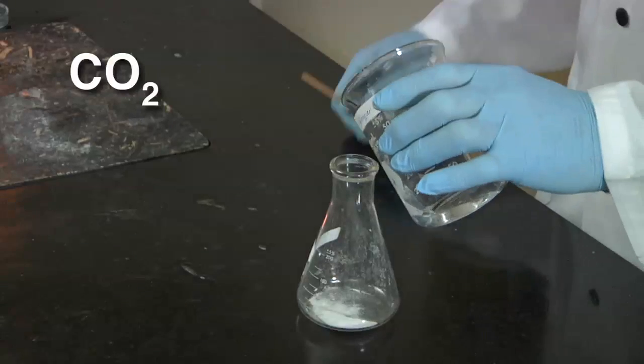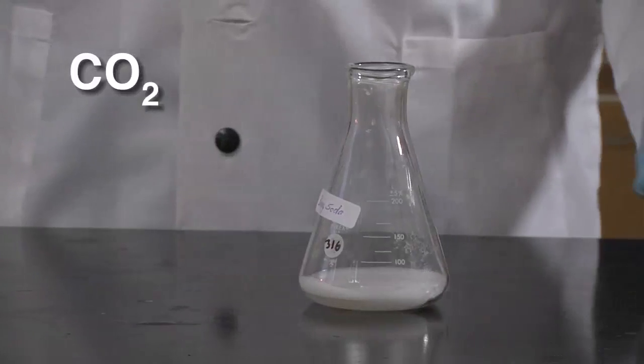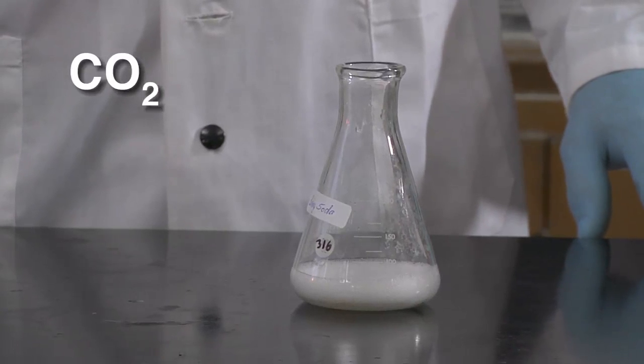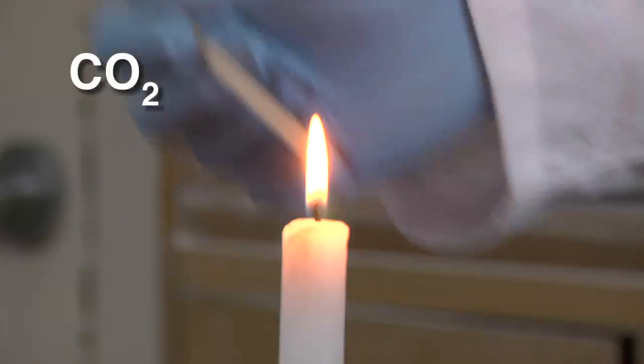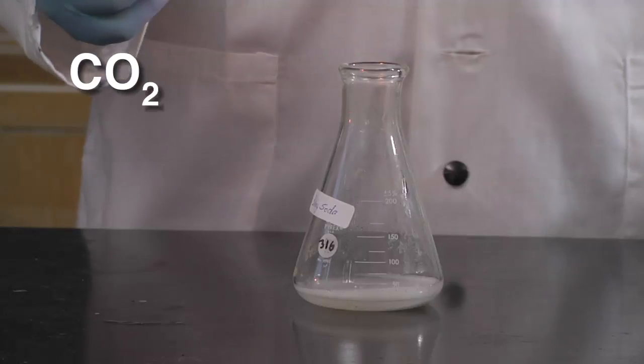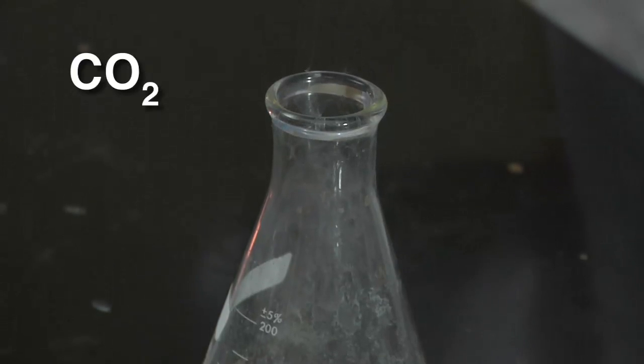To produce carbon dioxide gas, add about half of the vinegar to the Erlenmeyer flask with the sodium bicarbonate. The reaction will proceed quickly. Carbon dioxide is denser than air and stays in the flask. Prepare the burning splint and insert it into the Erlenmeyer flask. The flame is extinguished, which is one test for carbon dioxide.